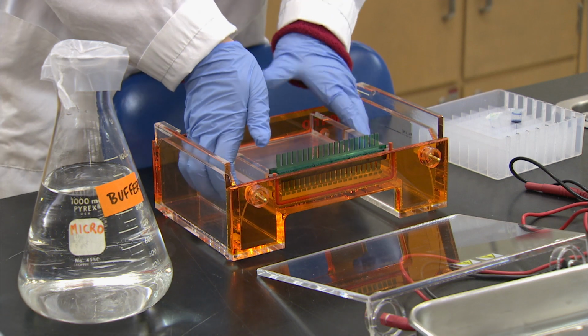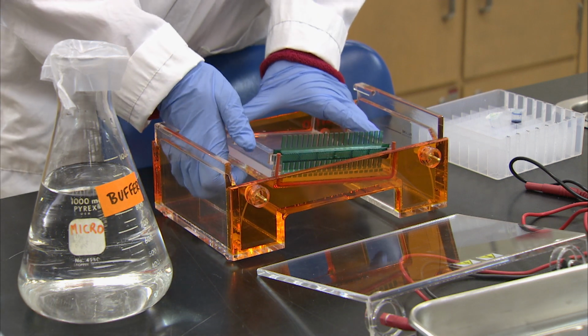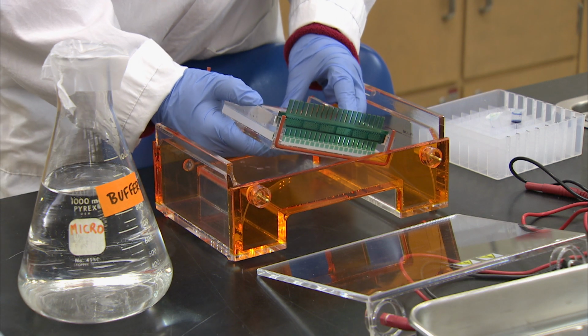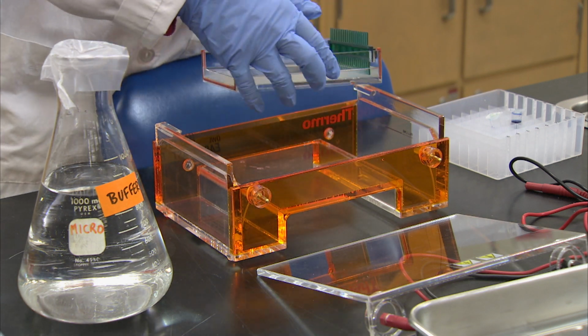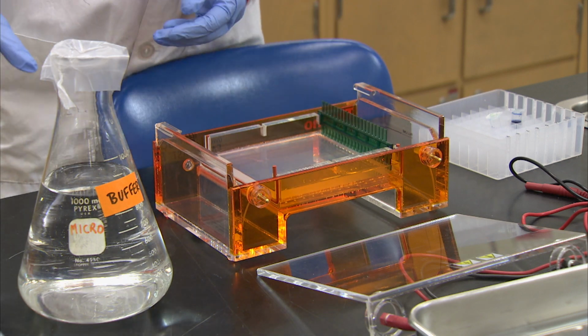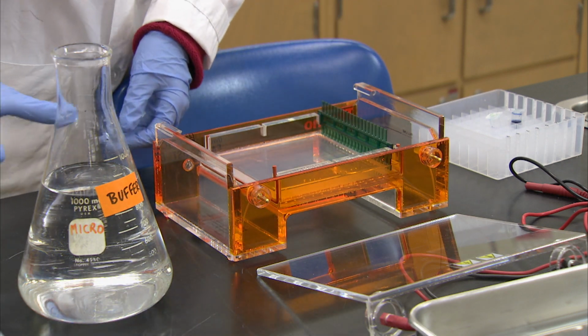Once the gel has become more opaque and is fully set, it can be rotated back into the running position. Make sure that the comb is located on the side of the tank with the black or negative electrode to make sure the gel will run in the right direction.